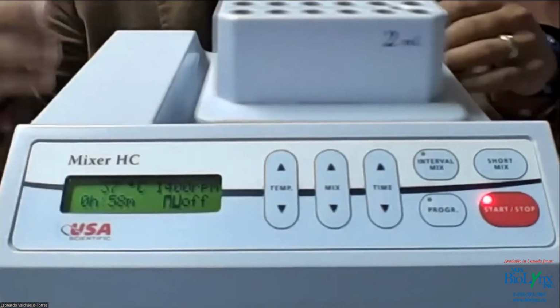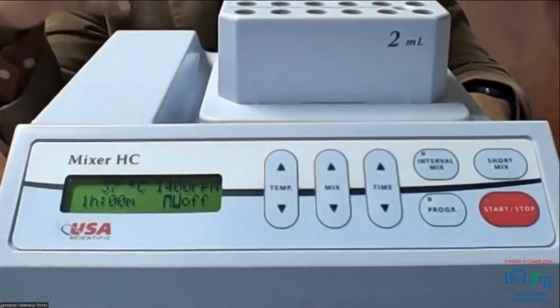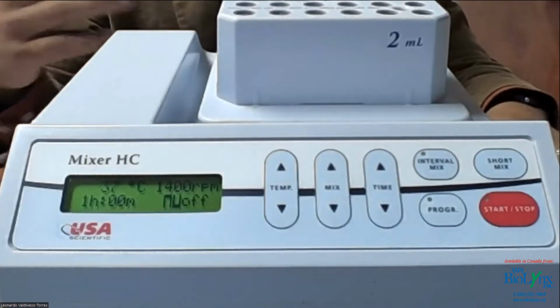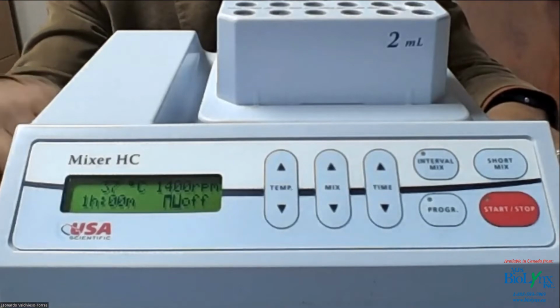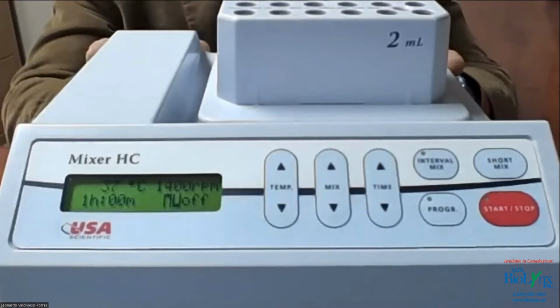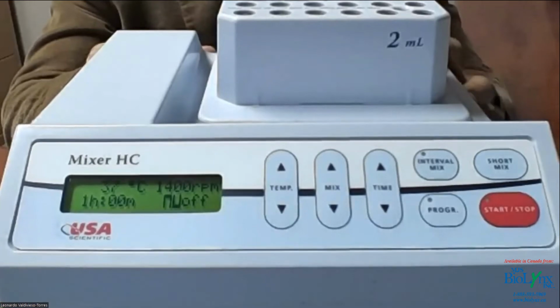I had an opportunity to show you two of the most complex protocols, and how to program them. There's probably a lot more to do, but I wanted to have something application based. Those are two of the three applications that I found very useful, and it can do a lot of things in the laboratory. You normally have the water bath, the incubator, the heating block, and all of these things can be replaced with this equipment. And honestly, the price is a pretty good deal for the amount of functionality you get.